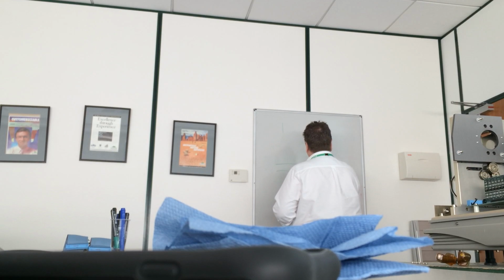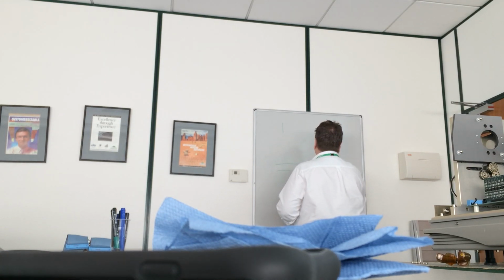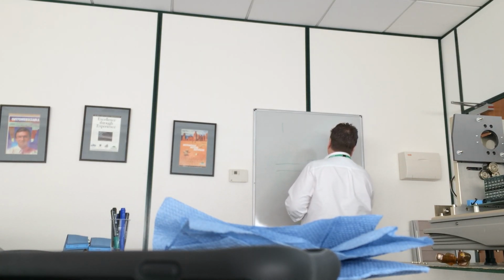This is our laser. We'll put our flow cell here. We'll put our detector there. Sorry, the receiver lens there. And there's our detector.